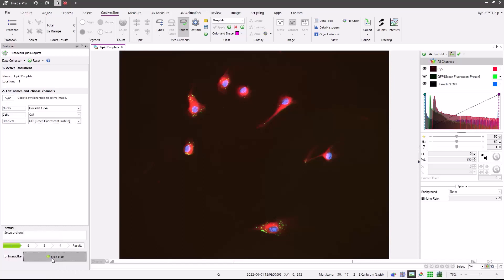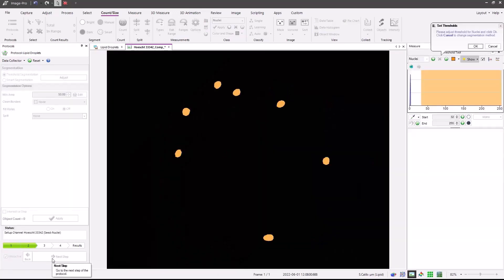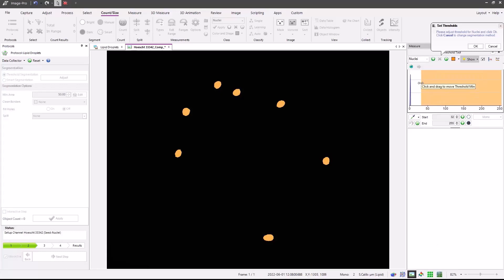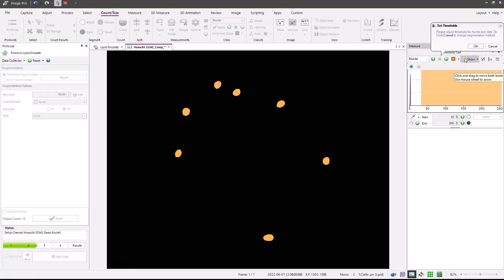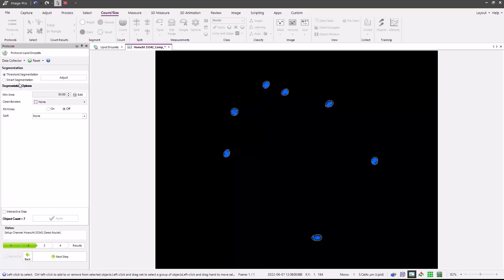Press the next step button and now segment the nuclei. In this case, we're using intensity threshold, which can easily be adjusted by adjusting the slider or pressing the auto threshold button. We may also use smart segmentation or machine learning if we choose to. Here, the nuclei are very well identified.